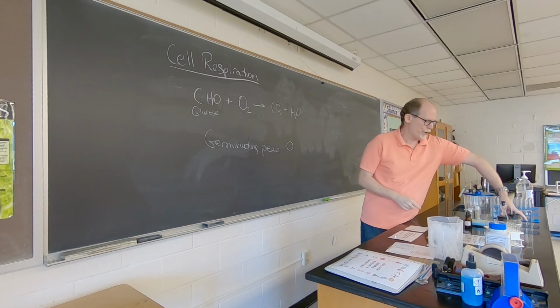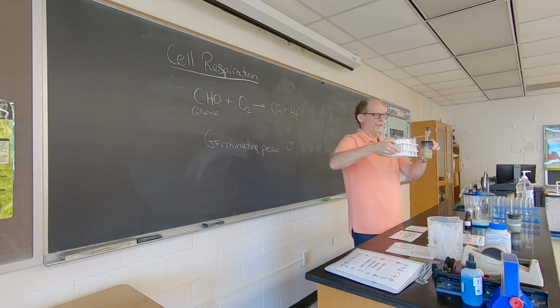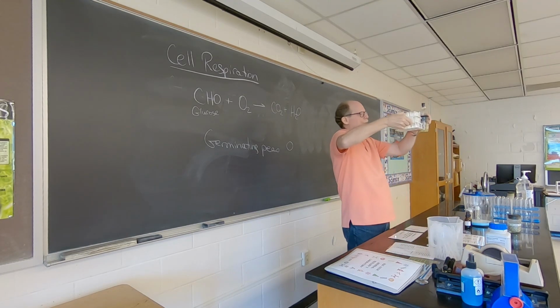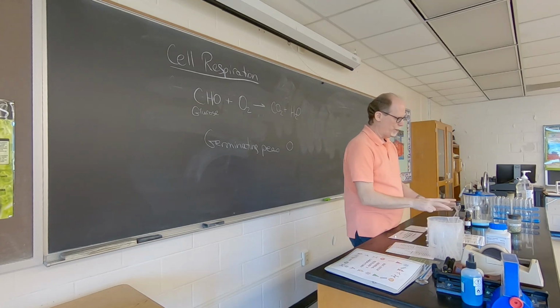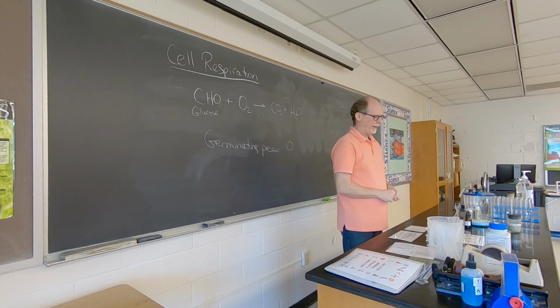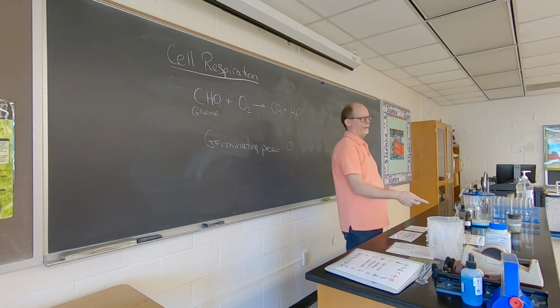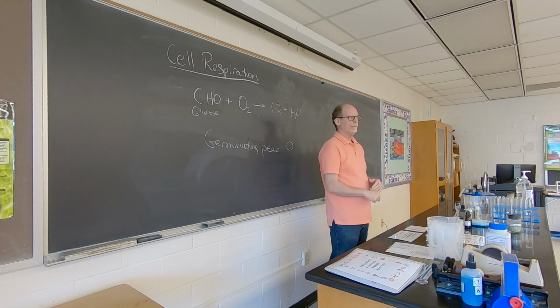Then I've got this jar with germinating peas in them. And I've got them in an enclosed jar. It's all stoppered up. I've had this going for the past couple hours. Normally you would set this up at the start of lab and let it go for an hour.